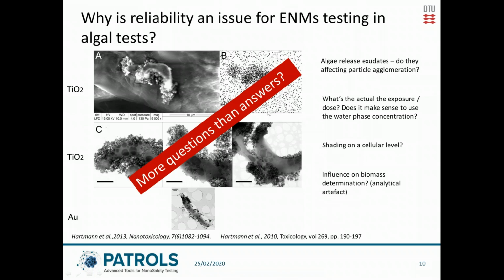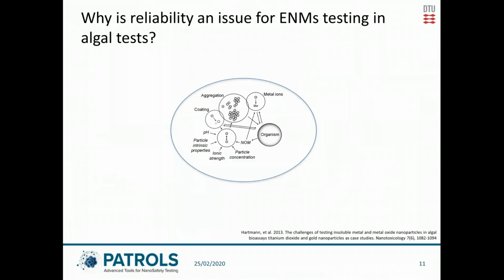Some would claim that when we do the algae testing, we actually only contribute by raising more questions than actual answers. This is not very good for the reliability of the testing. It's interesting and fun for scientists, but it is a big problem for the regulatory use of the tests. So basically, we could say there's a number of processes that pitch in and make this situation quite bad. In the circle here, you could say there are a lot of scientific issues to try to figure out, all these equations. But that's not the angle that we have taken in this part of the work in PATROLS.